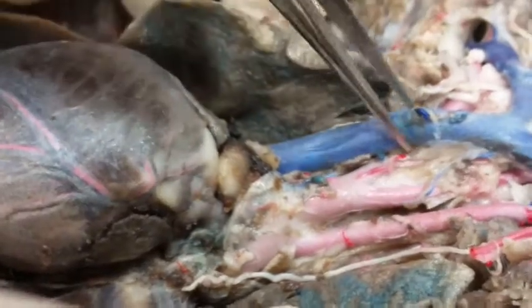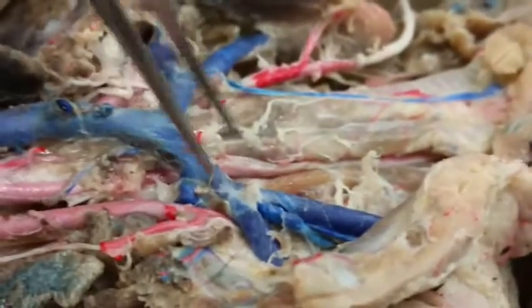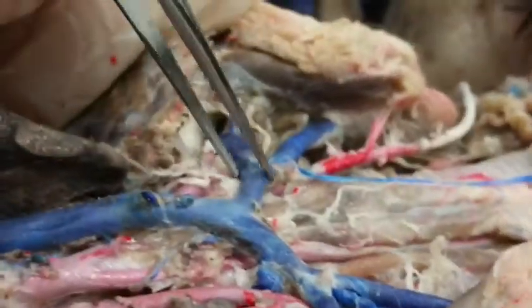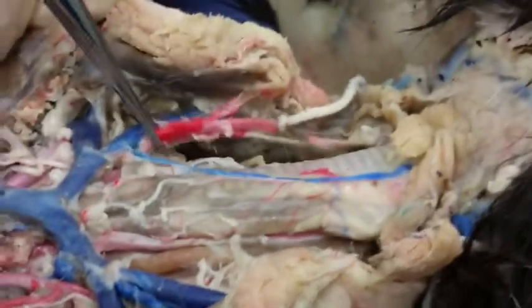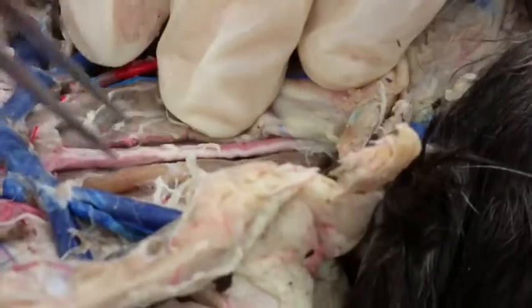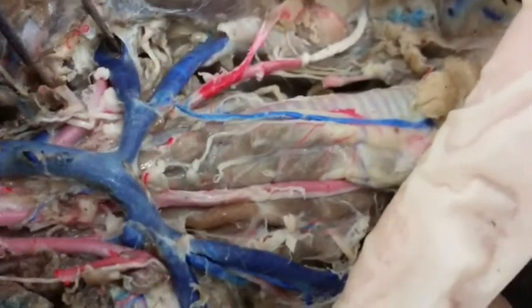As we come up the vena cava, you're going to get the left brachiocephalic vein and the right brachiocephalic vein. You're going to have the right common carotid artery, and then you'll have the same thing over here with the left common carotid artery. Over here and over here are the external jugular veins, and along with the branched subclavian veins.